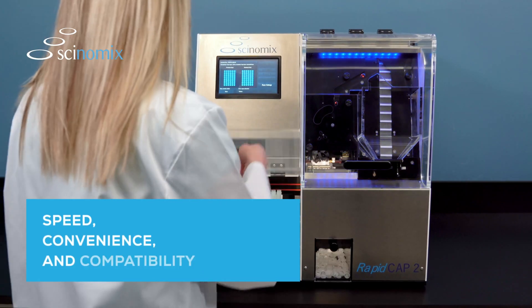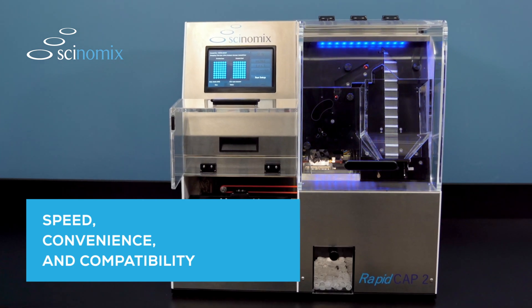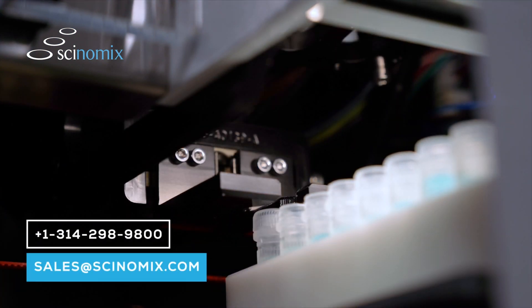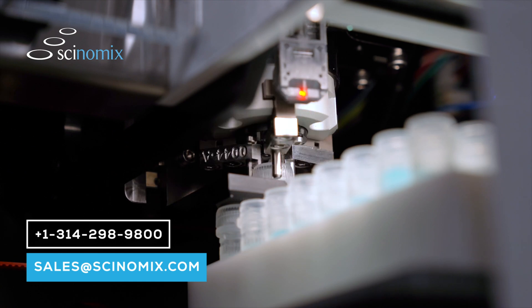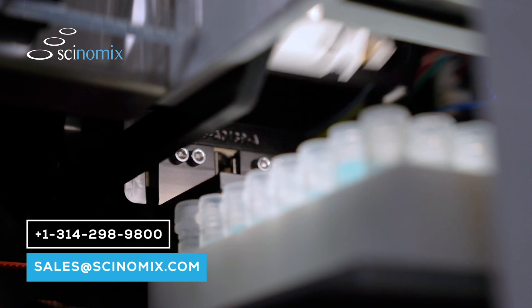Speed, convenience, and compatibility with inexpensive tubes makes the Scinomix RapidCAP 2 a clear favorite for modern and efficient labs. For more information or to schedule a hassle-free demonstration, please contact your account manager at sales@scinomix.com or by calling 1-314-298-9800.